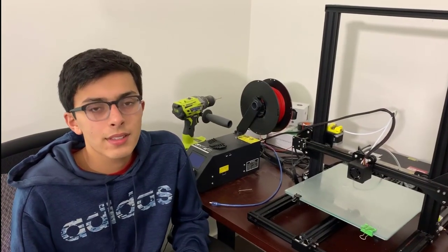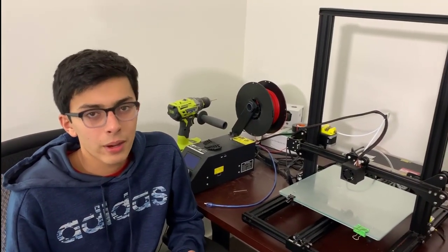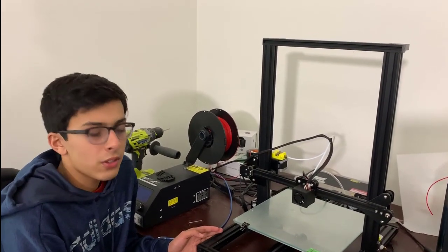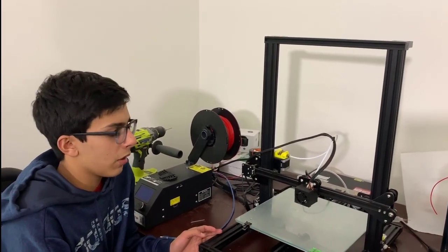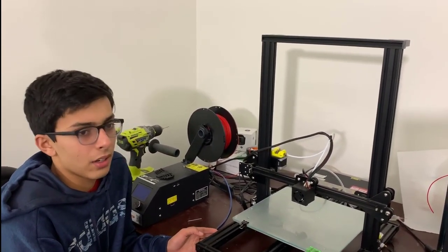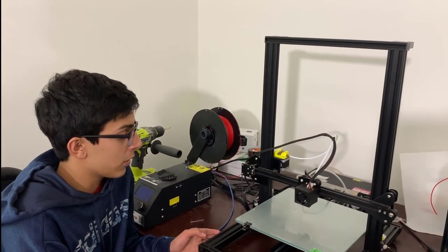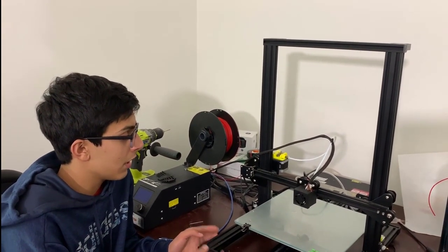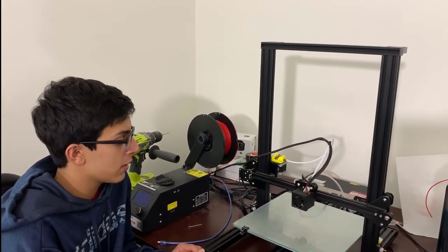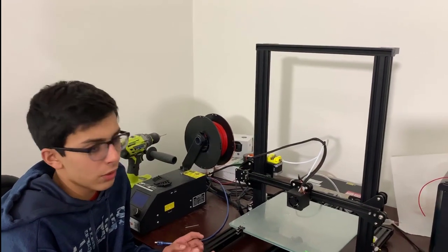Here's a list of components that we will be using to make our bioprinter. The printer that we are going to be modifying is a Creality CR10. We're choosing to modify this printer specifically because of its open design, its precision, and because it's relatively cheap.